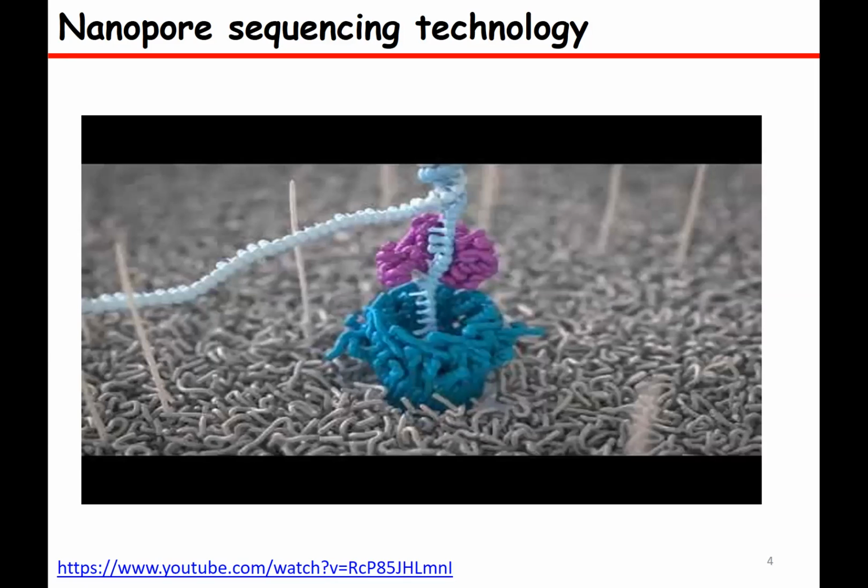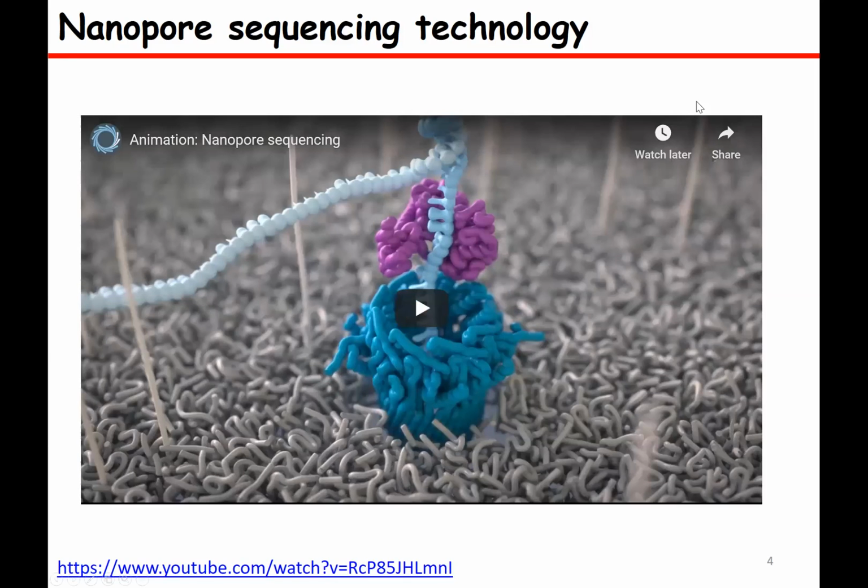Before I introduce nanopore sequencing technology, I'd like to show you this video of less than 2 minutes, which will clearly depict what I'm going to explain in the forthcoming slides. So let's watch it.